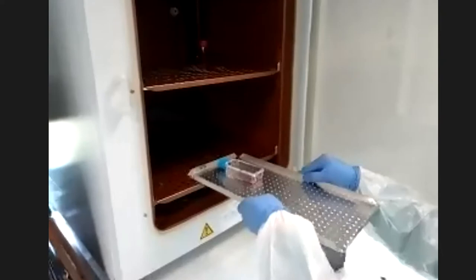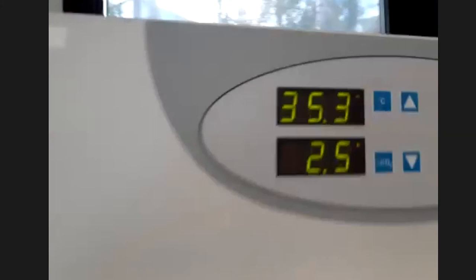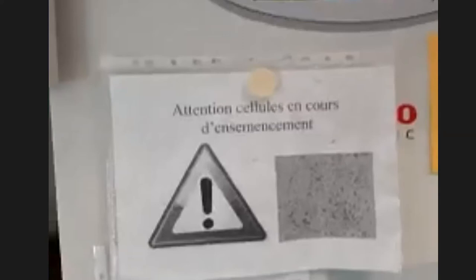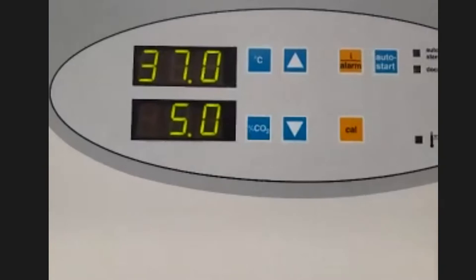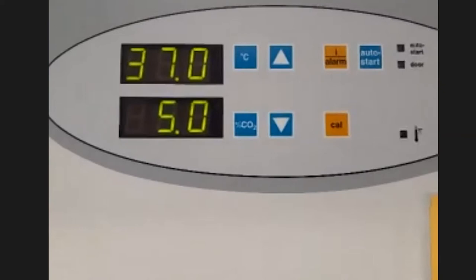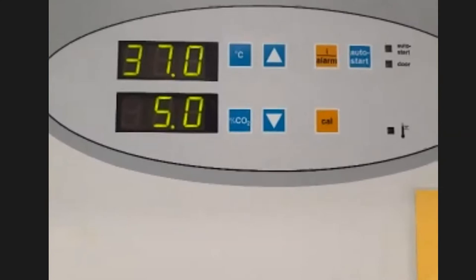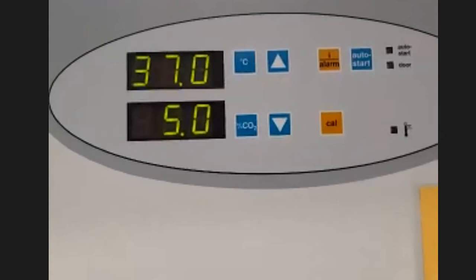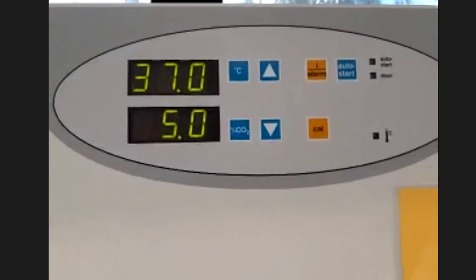Il faut faire attention: il ne faut plus bouger les cellules dans les heures qui suivent pour qu'elles puissent bien s'adhérer. On met une petite notice pour indiquer que les cellules sont là. Si l'incubateur est bien fermé, on doit avoir 37°C avec 5% de CO₂. Attention: quand vous ouvrez un incubateur, vous ne le laissez pas ouvert trop longtemps — vous devez travailler le plus vite possible, car la température et la teneur en CO₂ chutent très rapidement.